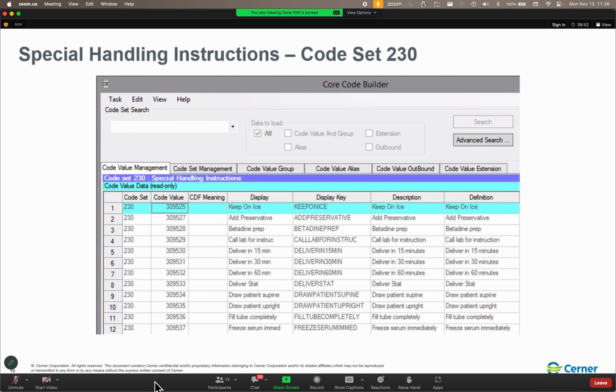And you're running around and you're running errands and you may not be home for an hour. Yeah, in the case of a lab, you've got specimen integrity issues, because if the frozen specimen doesn't remain frozen, that's going to be a problem. If the room temperature specimen gets too cold, that might cause a problem.